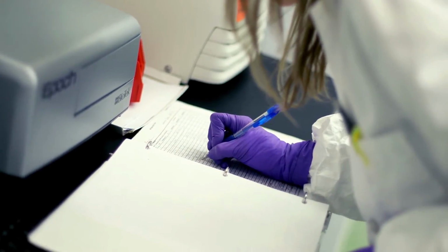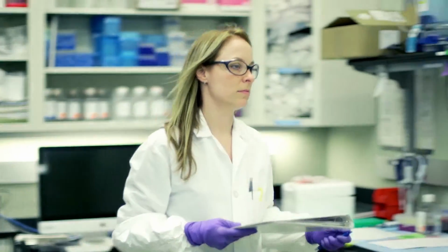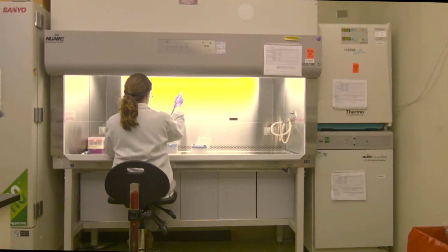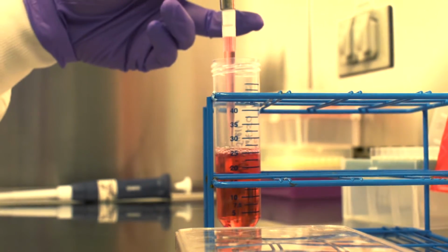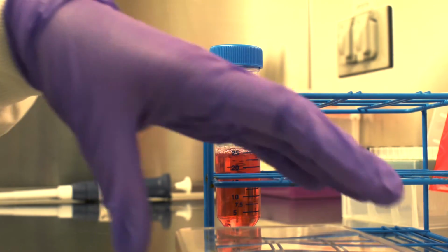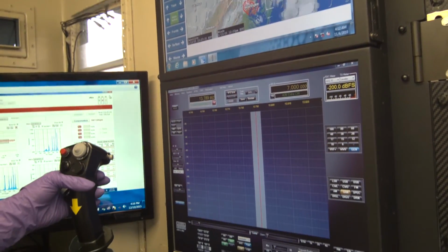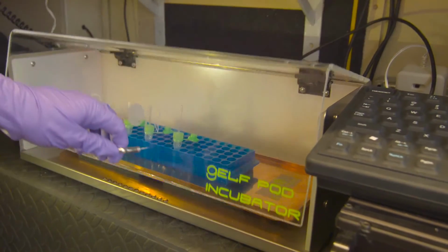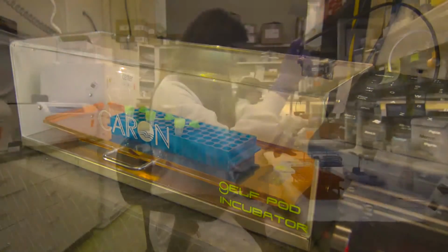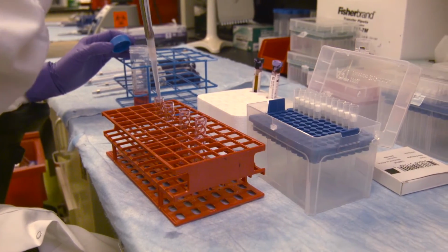Flow cytometry is relevant for everyone on this planet. It not only is a gateway to understanding the human condition, but it's also the gateway to ultimately understanding our relationship to the planet itself. Flow cytometry can be used to monitor global warming. It can be used to monitor the outbreak of new pathogens. So ultimately, it's something that we all will care about or should care about. It's a great growth industry.